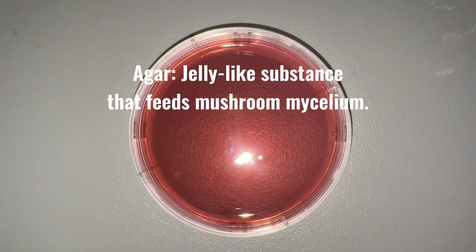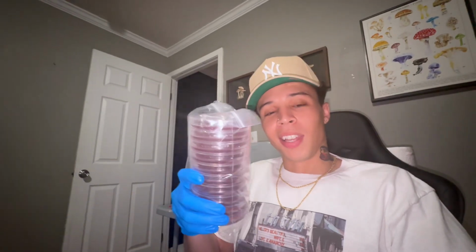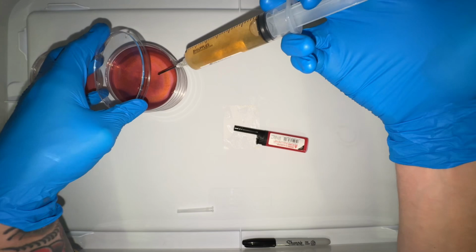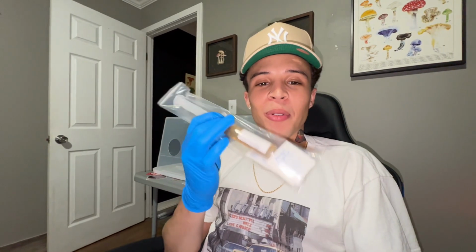Agar, a jelly-like substance that feeds mushroom mycelium. And this is the agar that I'm going to be working with today. I'm going to be working with shiitake strain LE3790. Squirt a little bit of this out onto a petri dish, and then we're going to look at the growth to make sure it's not contaminated before we take this to grain.